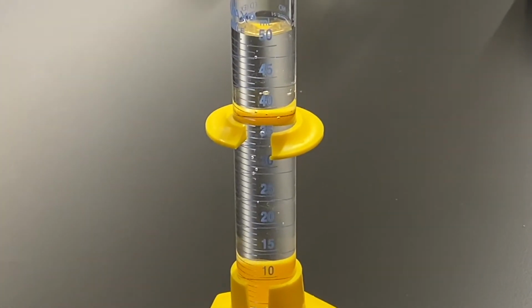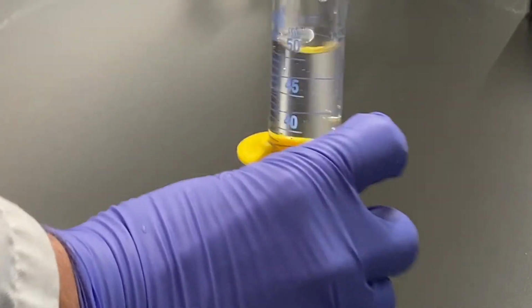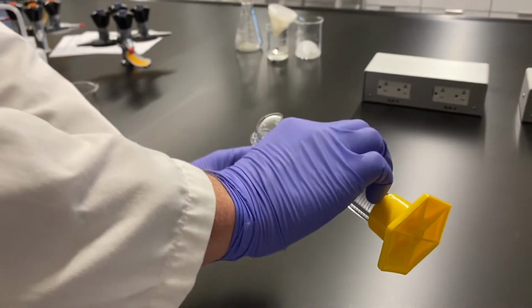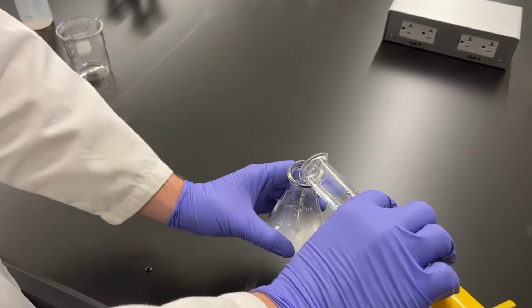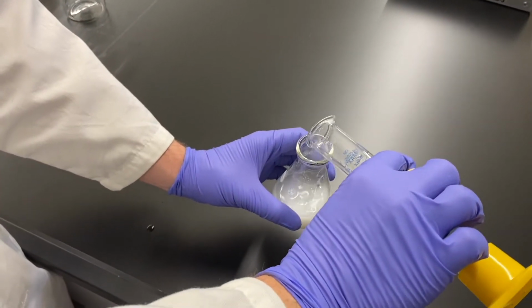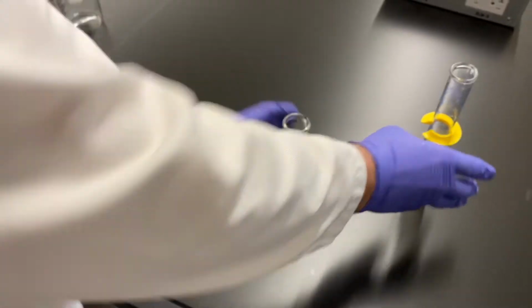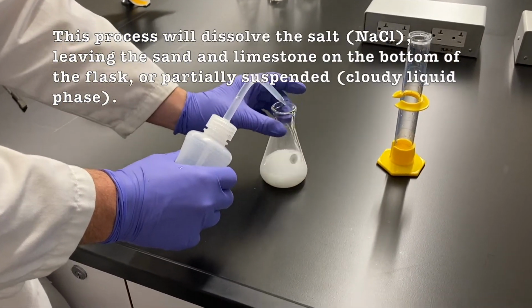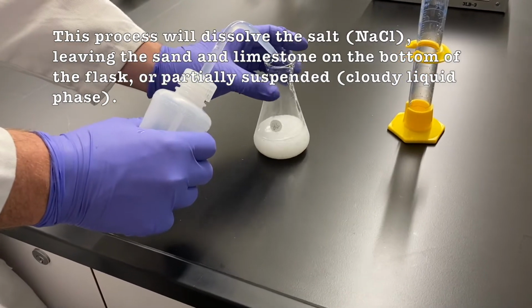All right, so we're going to be adding water to our mixture. Again, we have salt, sand, and calcium carbonate. Salt easily dissolves in water, as I'm sure you know, but the other two components won't. So whatever is dissolved in the water will just be the salt.